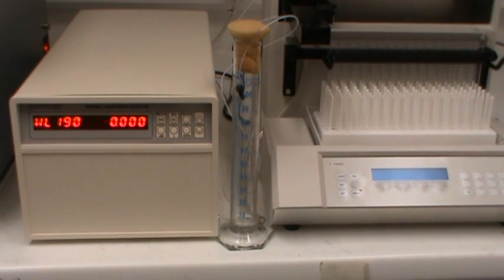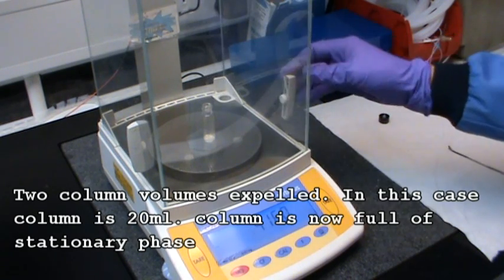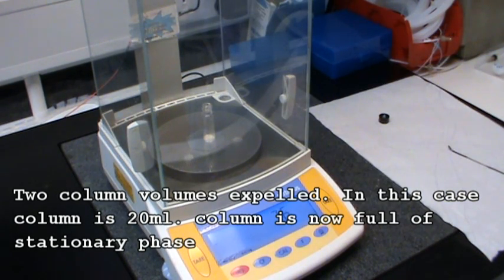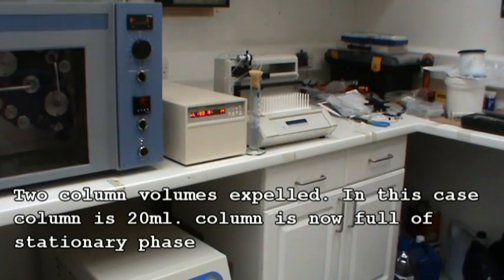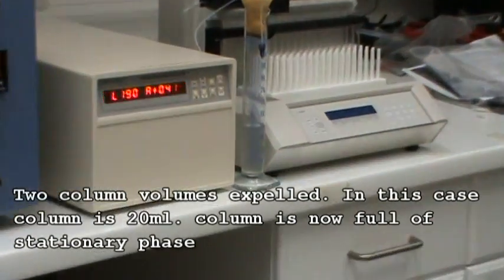Whilst the column is filling, start to measure out your sample. Once 40 ml or so of solvent has been expelled from the column, the column is now full of stationary phase.